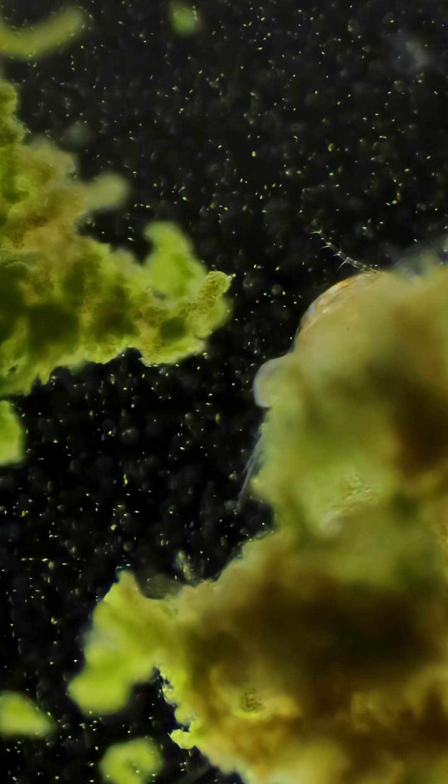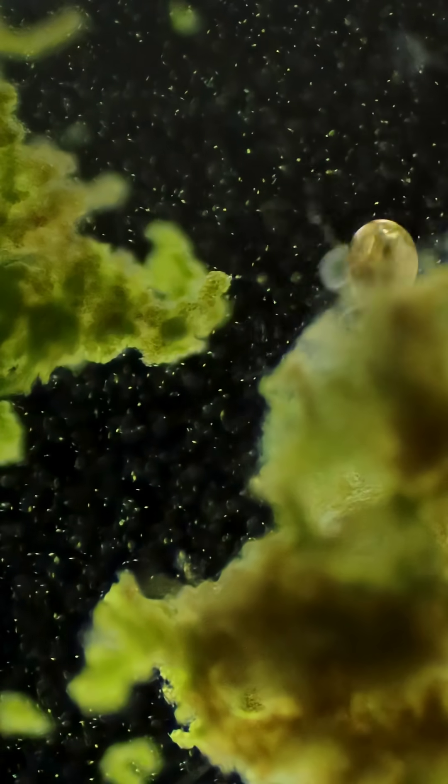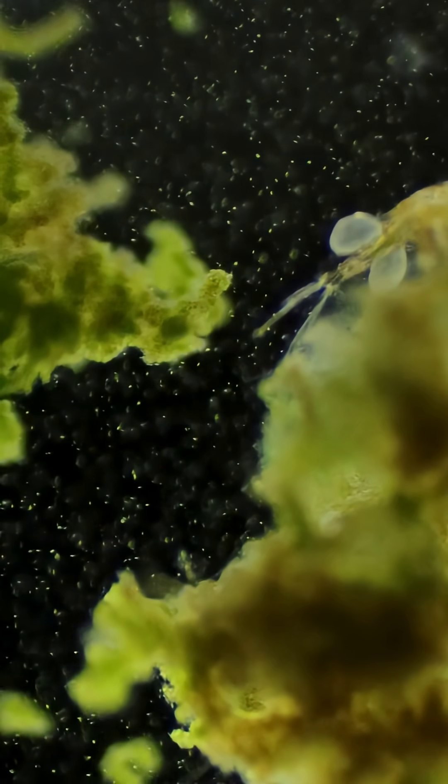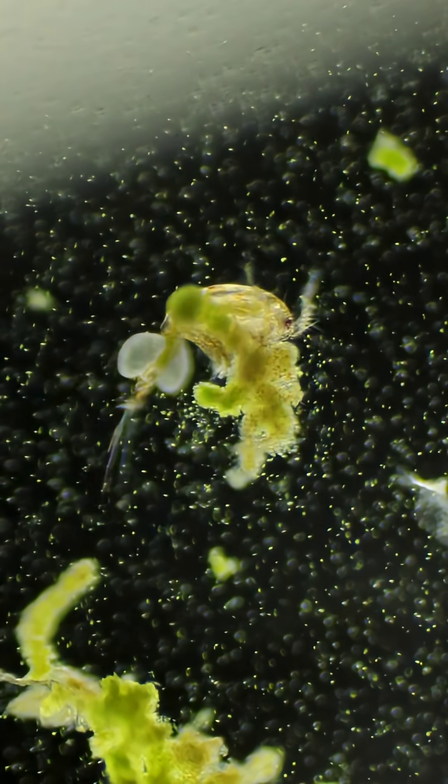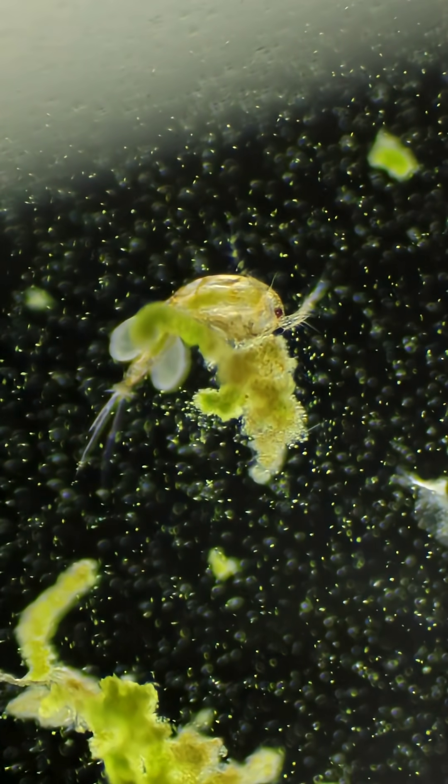These little guys are so tricky to film. The moment you catch them slightly in one spot is the time you just let the camera do its thing. It reminds me of like a little mini cyclops. So alien-like.